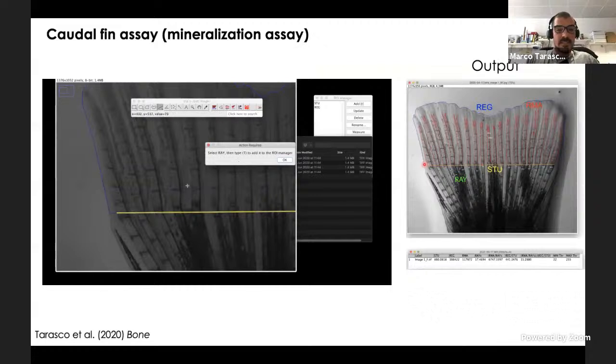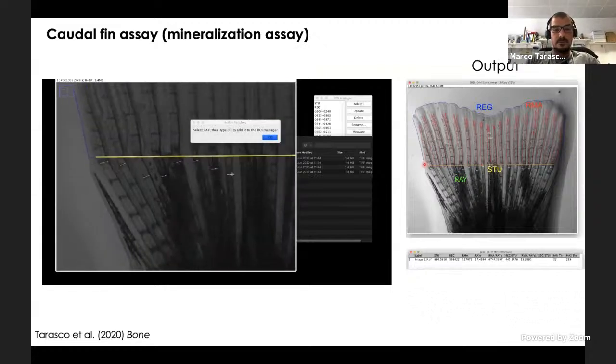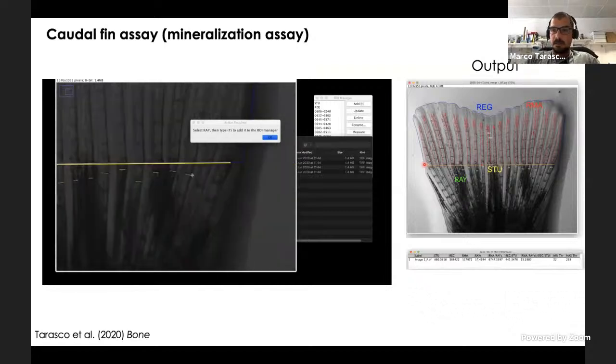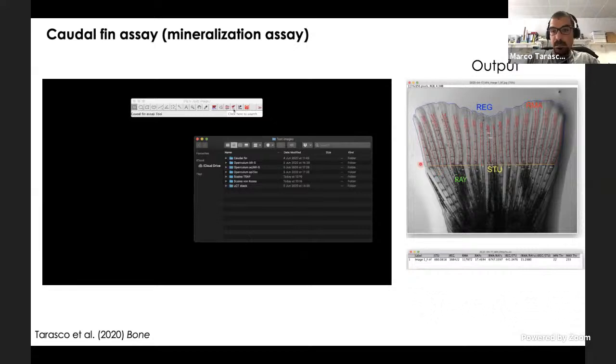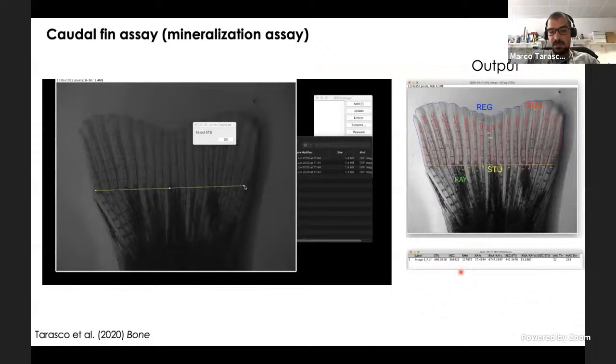As you can see, some steps are still semi-automatic. They still require user input, since between different labs and so on, it will be difficult to really automatize everything. And that's it. This really saves a lot of time, and the data processing is automatically done.